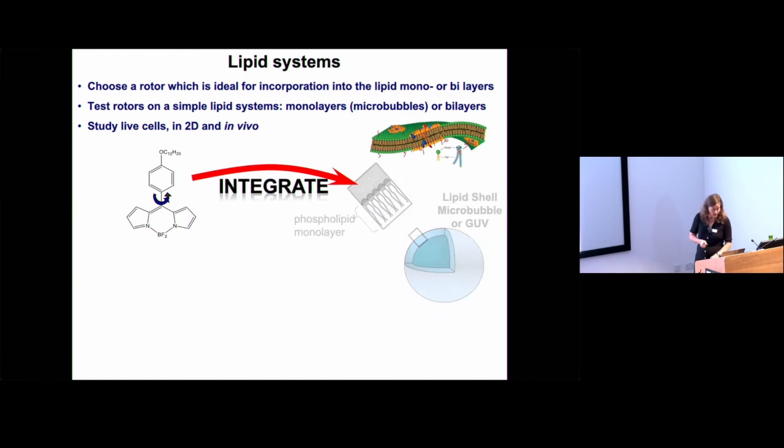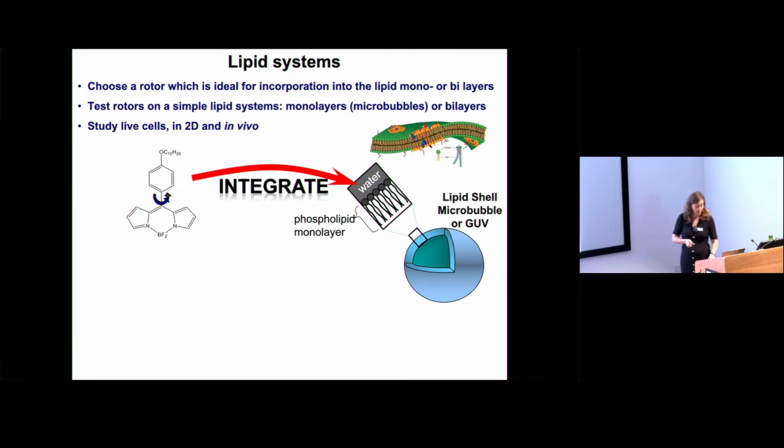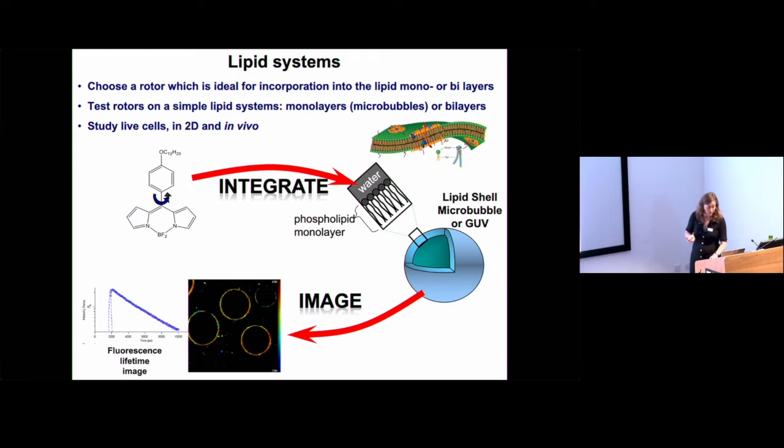Okay, so let's start again with one of my favorite rotors, BODIPY-based, and how we measure viscosity with it in lipid membranes of various origin. So we have our rotors that, due to their hydrophobicity and structure, incorporate seamlessly into monolayers or bilayers of biological membranes. And then we can perform confocal or multiphoton imaging of the rotor incorporated in the membrane.